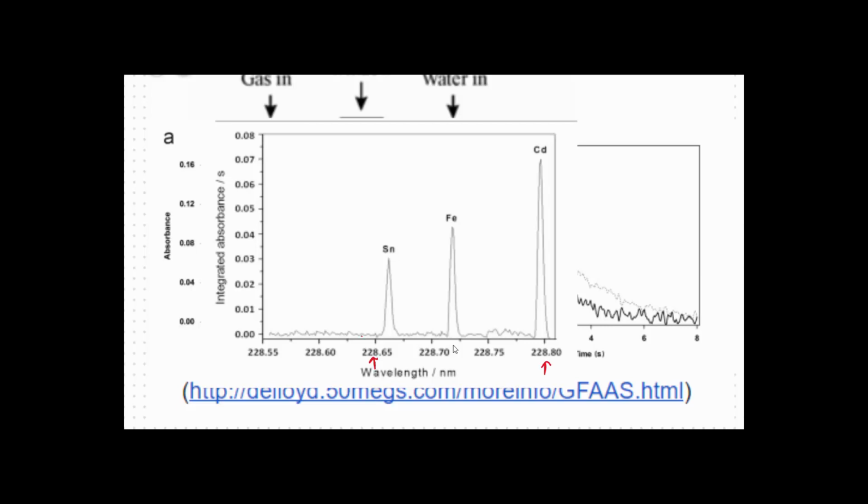See how we come from the baseline clearly up to a peak and then back down to the baseline? That's the resolution we're looking for whenever we're scanning with one of these instruments. You're looking for baseline, clear up, peak, and then come back down. That's what we refer to when we're talking about the line width or the bandwidth. We're looking for that clear resolution in the peaks.